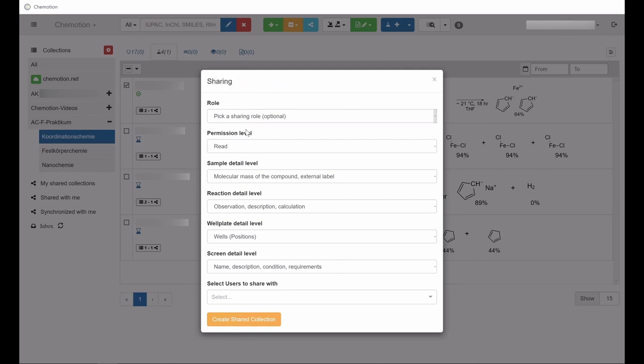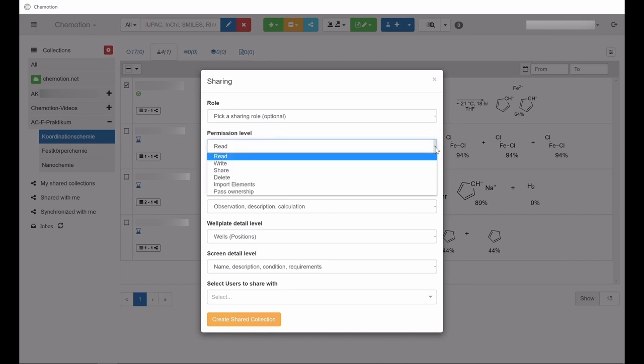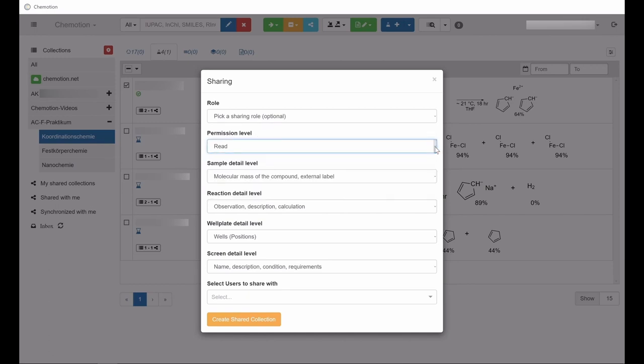Not only is it possible to adjust the degree of access for different elements in commotion, but also to specify the level of disclosed details for reactions, samples, and so on.